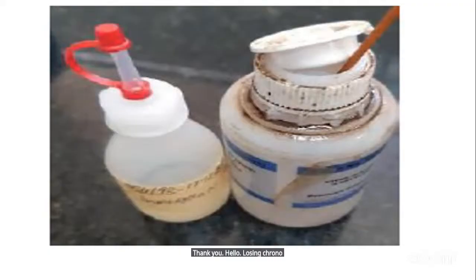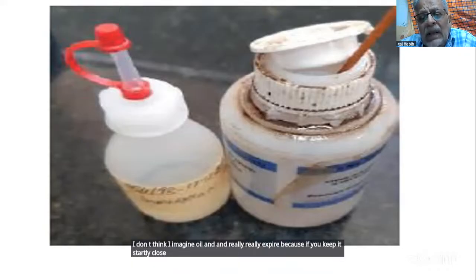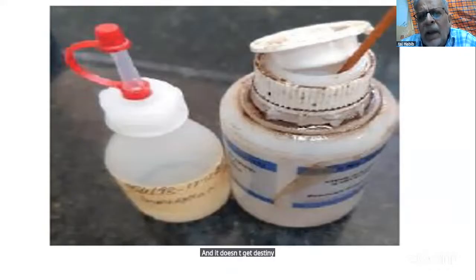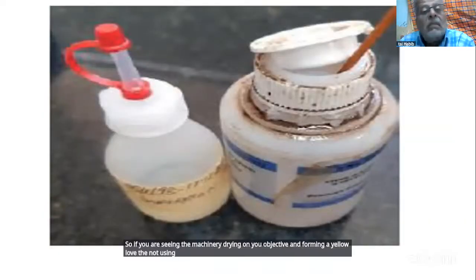Elosin Kirota is asking, does expired oil immersion have an effect on the microscope? I don't think immersion oil really expires, because if you keep it tightly closed and it doesn't get dust in it, it shouldn't expire really. It has a good 5-year life. It doesn't dry. That is one of the biggest qualities of immersion oil. So if you are seeing immersion oil drying on your objective and forming a yellow blob, you are not using the right thing.